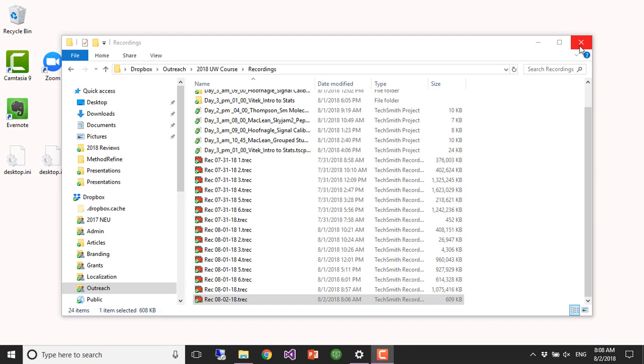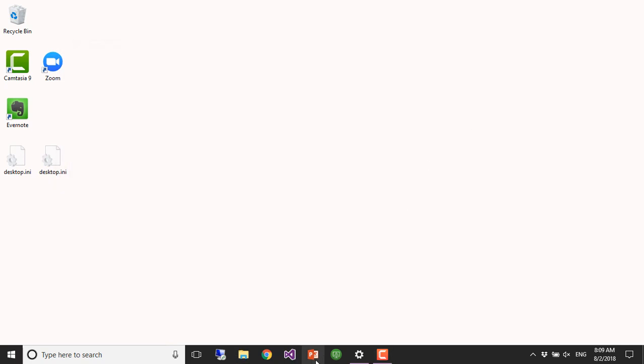end up using. I mean, there's a set of known standards, all of which Skyline supports. And if you're using C18 chromatography, then the existing standards and their trainings will work just fine. We also do more auto training. And so, if you don't want to try to train an endogenous standard or use your own heavy labeled peptides as your iRT standard, then you probably won't do what we did the first time.